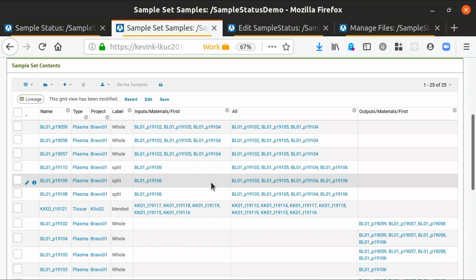and then the next generation of 100 samples will be collapsed. So if you've got 100 siblings from your parent, and then some of those children each have their own 100, they'll each have their own 100 below that, collapsed together. Does that make sense? And can the user view that node uncollapsed, or is it all fixed? The collapsing right now is fixed, but you can select the collapsed nodes.